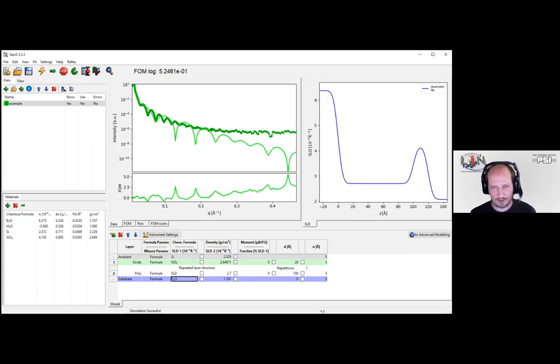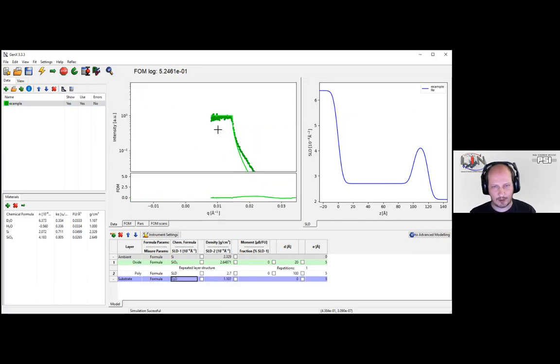And that's basically the model. What we see, we're going far below the data because we didn't define any instrumental background, and also the scaling we didn't define. So I just used the mouse here to see what's the background level. Down here we see 3 × 10⁻⁷ would be the background level. And let's zoom in to the critical edge to estimate that. So that's something like 0.88.